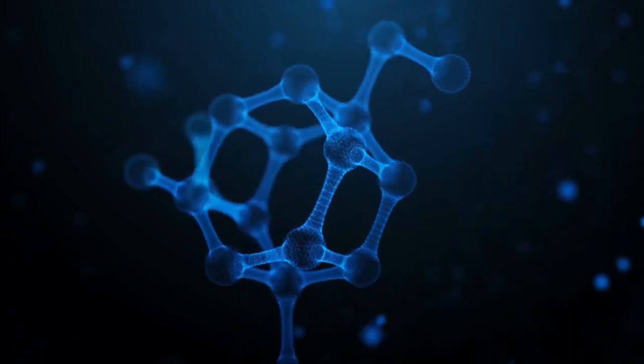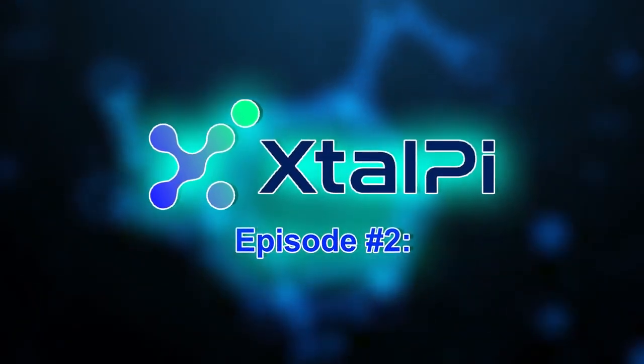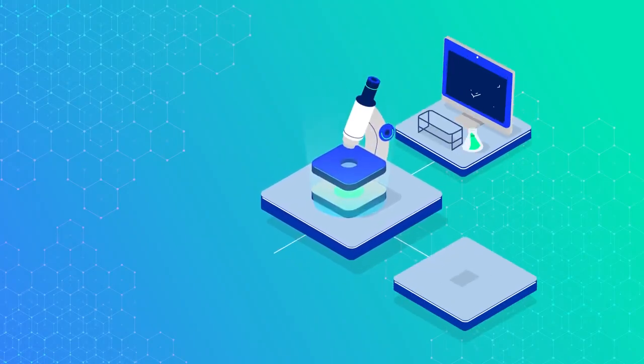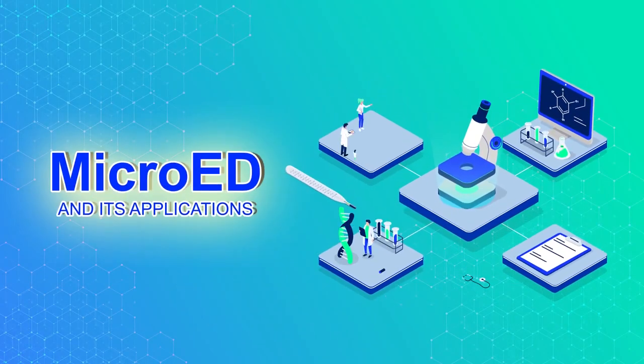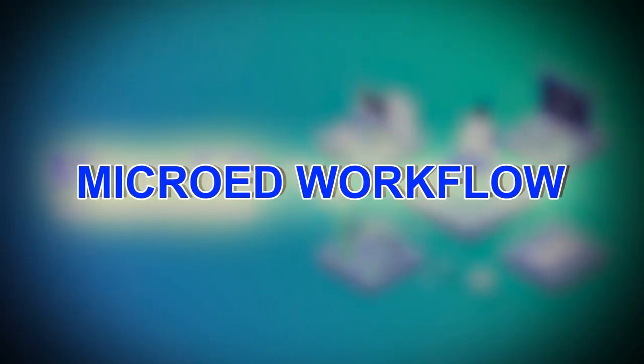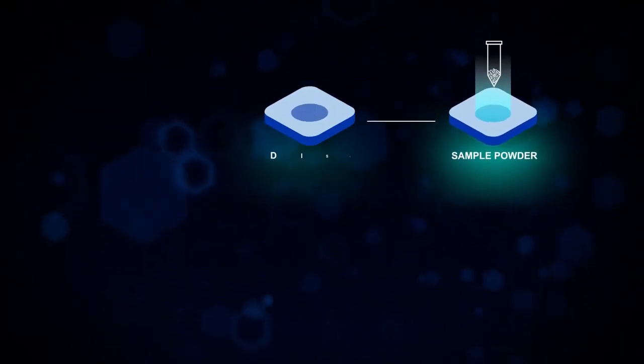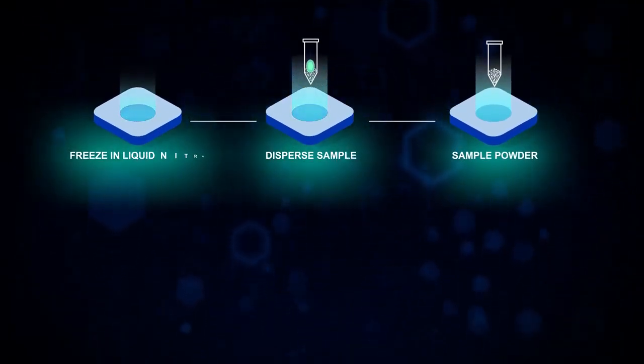This is Xtalpi Shorts Episode 2, where we will overview the MicroED workflow and introduce two case studies that demonstrate useful applications of MicroED to solid-state R&D. The MicroED project workflow starts by dispersing a crystalline powder sample onto a transmission electron microscope grid and then freezing the sample with liquid nitrogen.